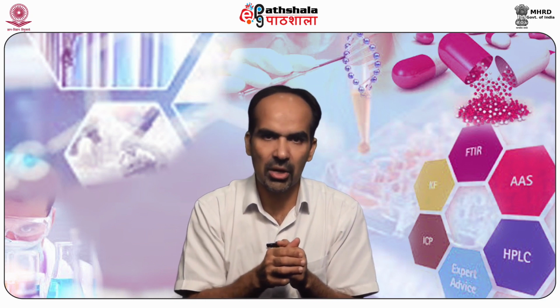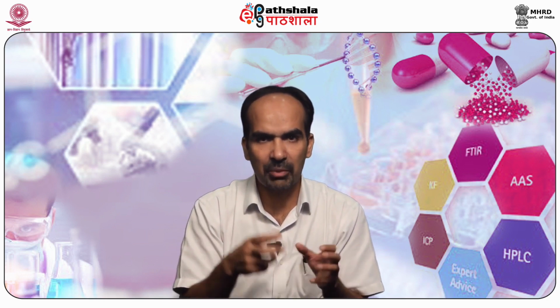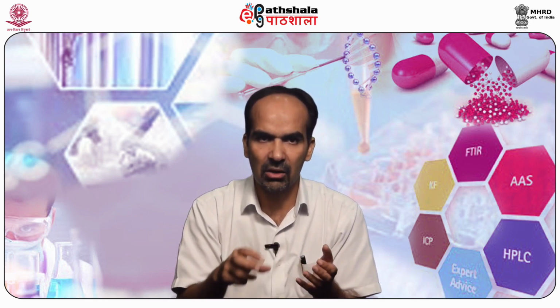The residue is dried and weighed. Quinine dihydrochloride, quinine dihydrochloride injection, and quinine bisulfate are assayed in the same manner. Quinine sulfate is sparingly soluble in water and is dissolved with the aid of dilute sulfuric acid, and the alkaloid is then liberated by addition of NaOH and extracted in the same way as quinine.